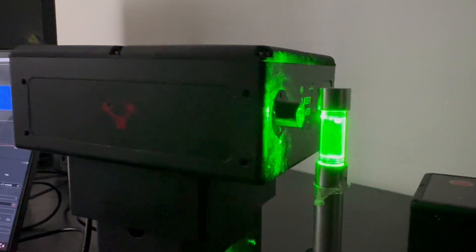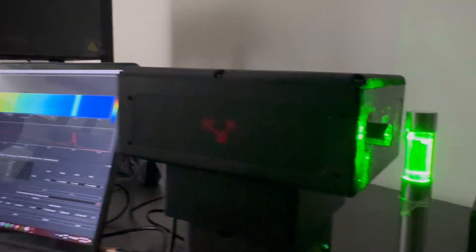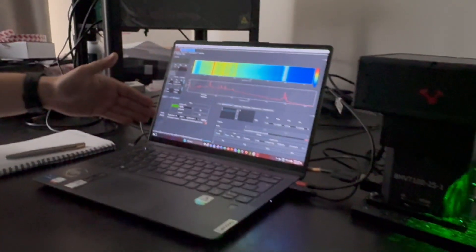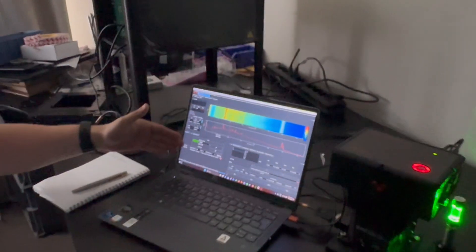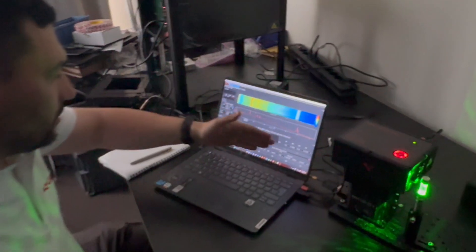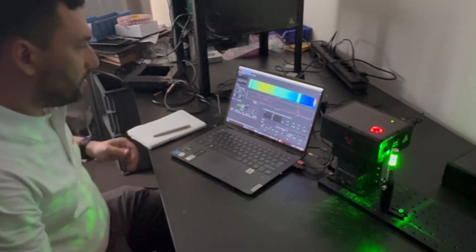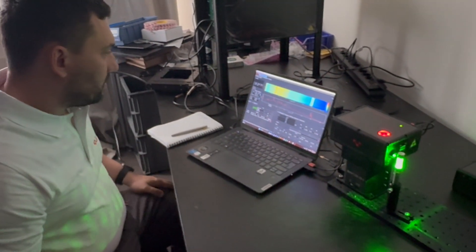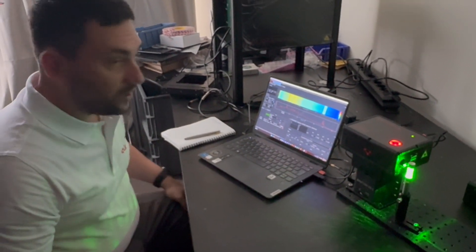So as you can see now the system has performed the scan. The exposure time was 100 milliseconds, 100 steps, and the scan was quite fast. Thank you for your attention.